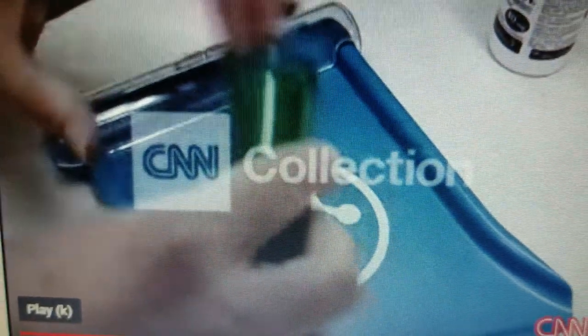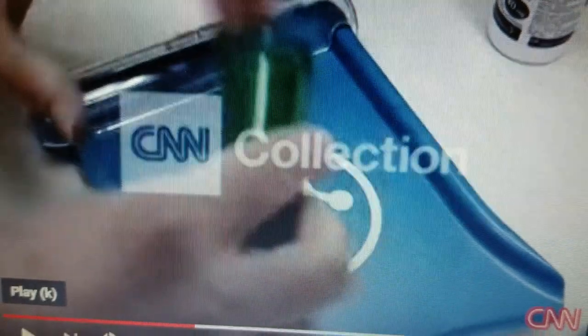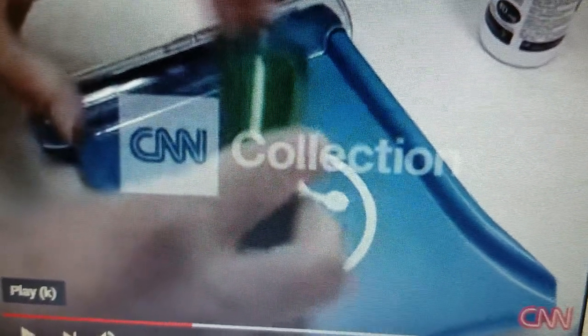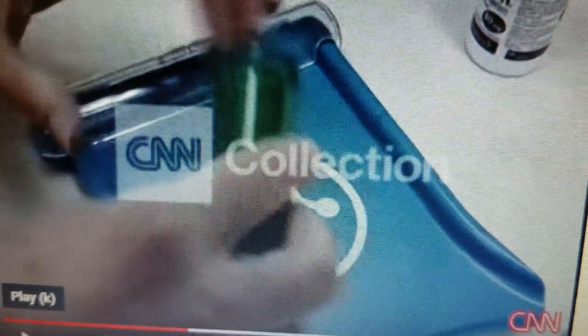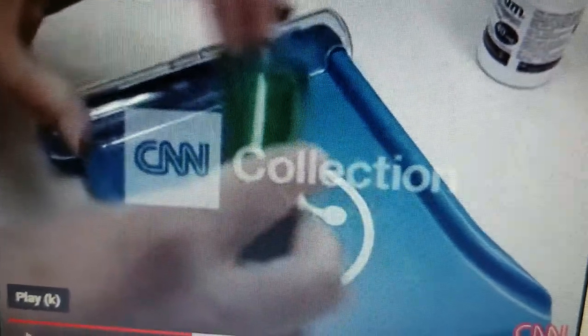All right, this is a really short little video of using a pill counter tray, typically what they use in pharmacies and hospitals. The easiest way to count is by fives, and of course if it's something like 27, you're going to count 5, 10, 15, 25, and you have two more — 27.